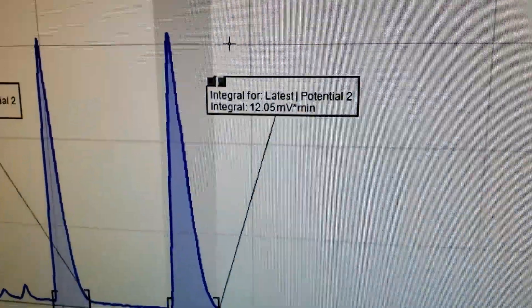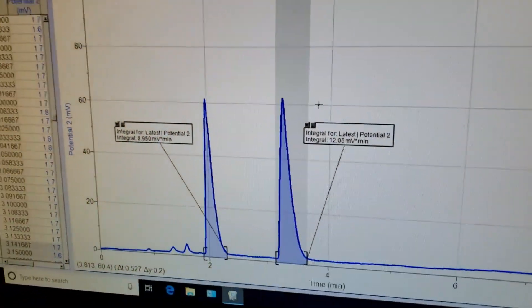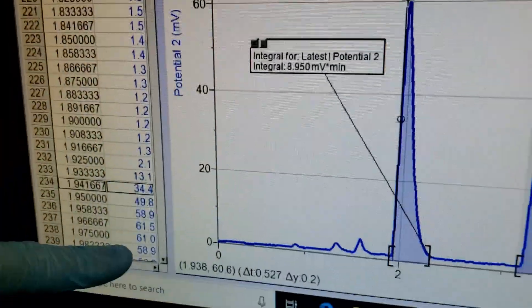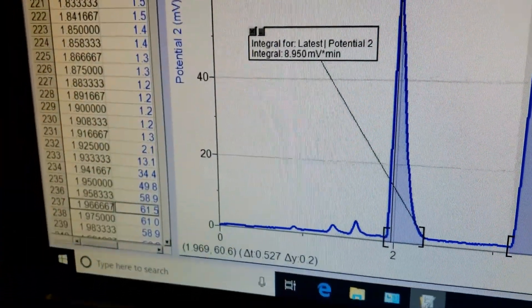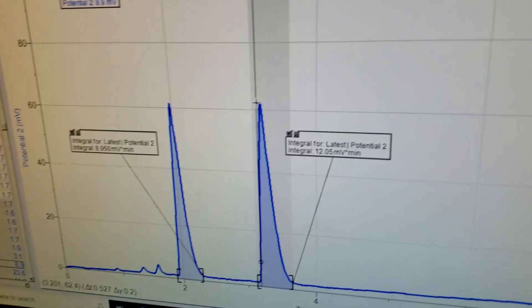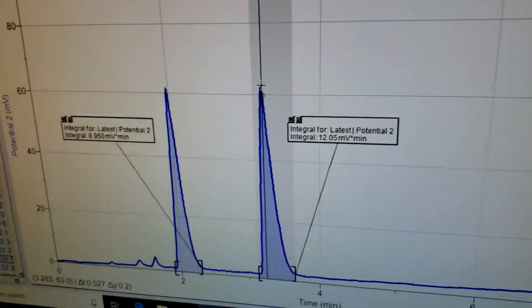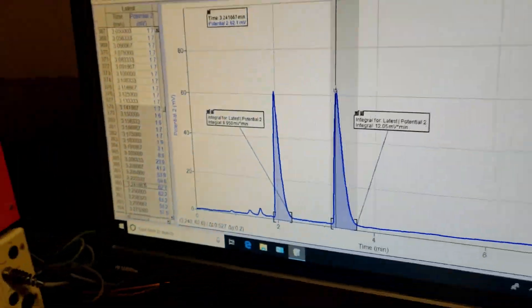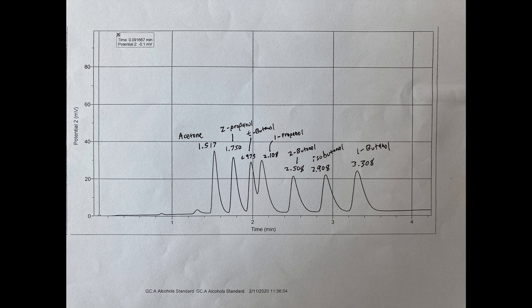Since our solution is equimolar we should expect to see that the areas of the peaks are the same or at least relatively similar. Each compound will then elute at a specific time called the retention time. The retention time is recorded as the highest point of the peak. You can also see this in the table as the highest potential. Record the retention time of each peak as this will let us identify the compounds present. We will then compare the retention times of our two unknown compounds to a set of standard retention times.